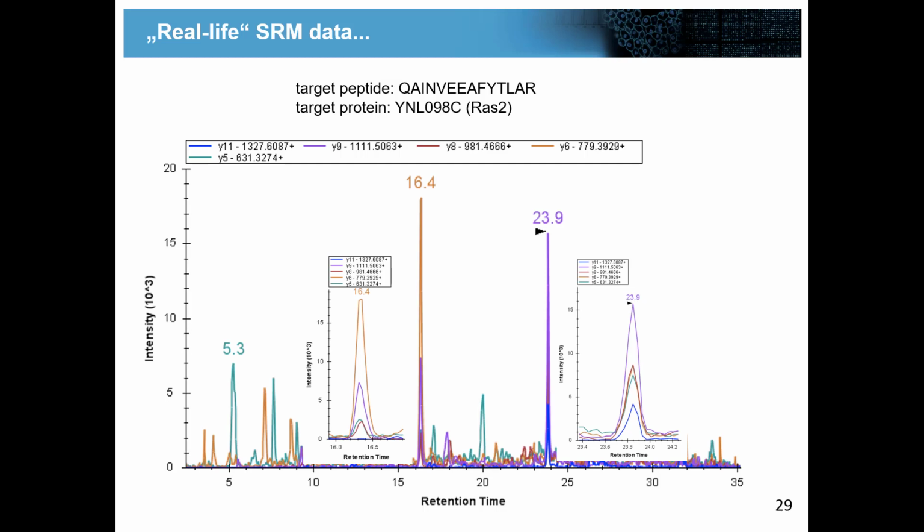Look into the spectral library. So in other words, I don't have a spectral library. What do you think? I don't have a heavy peptide. Yeah, I don't have a database. Then what? The internet's down.